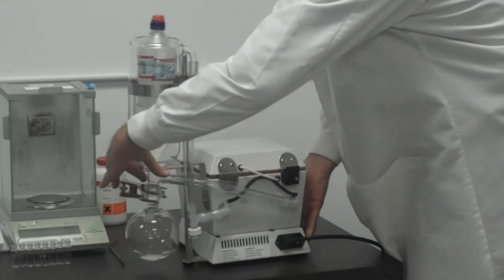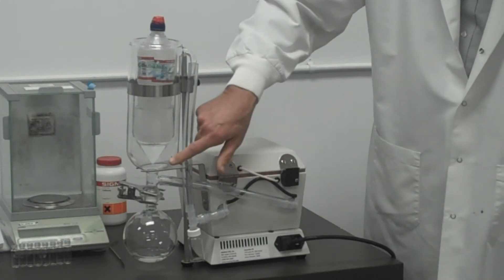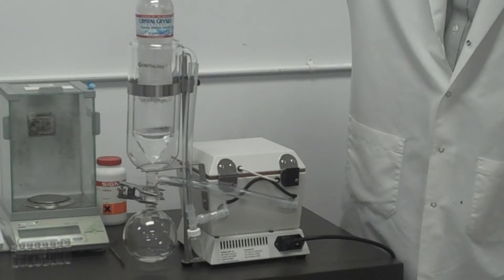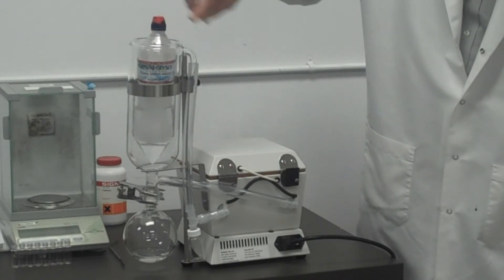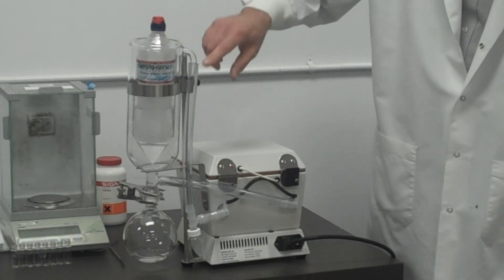This is accomplished by two lines. The outlet from the Centrifan goes to the cold trap, chilled by this frozen water bottle. For example, with this solvent, you can use dry ice and ethanol.